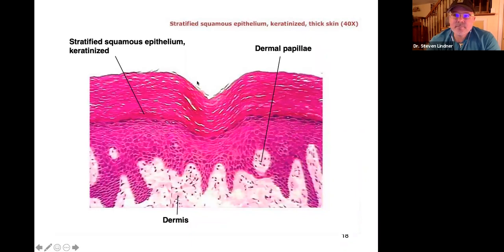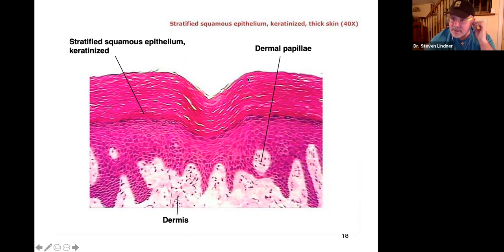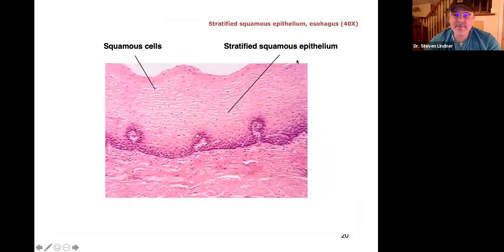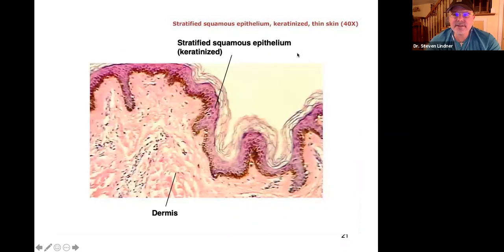Here is the skin. Look at the top layer — many flat, irregular-shaped cells. Not simple squamous, this would be stratified squamous. The epidermis is up here and the dermis is below. Again, stratified squamous epithelium at the top. Same for the esophagus: flat, irregular cells, maybe 25 to 30 layers of stratified squamous epithelium. Not one cell layer — many cell layers.